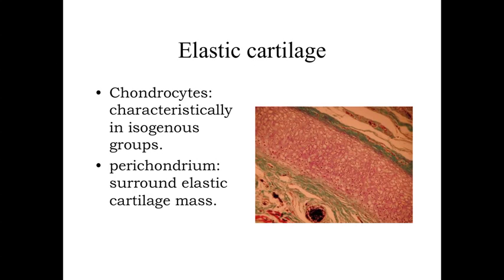So that was hyaline cartilage, the most common cartilage within the body. We also have elastic cartilage, and elastic cartilage is going to be very, very similar to hyaline cartilage with one major difference.